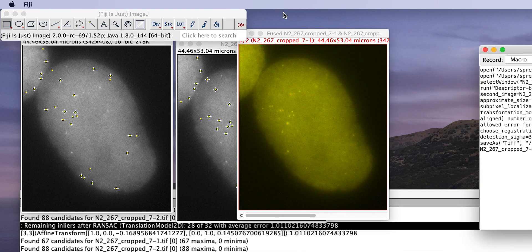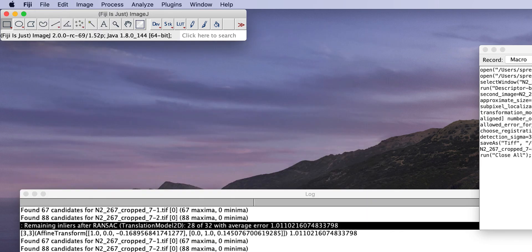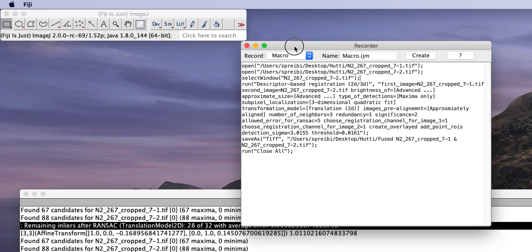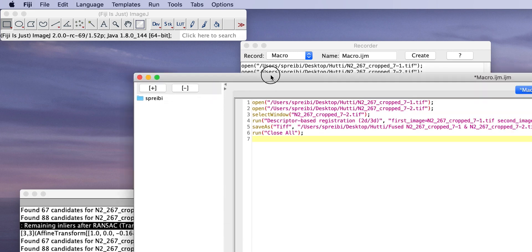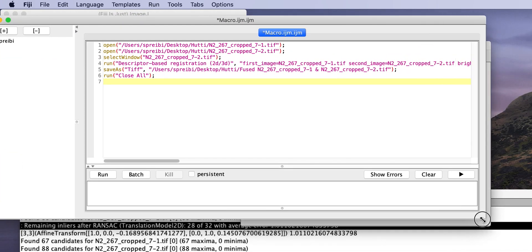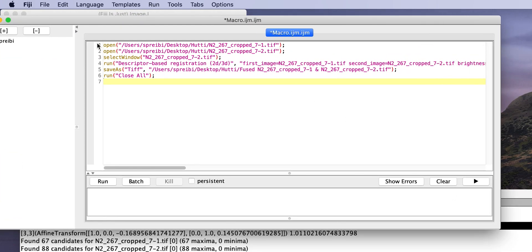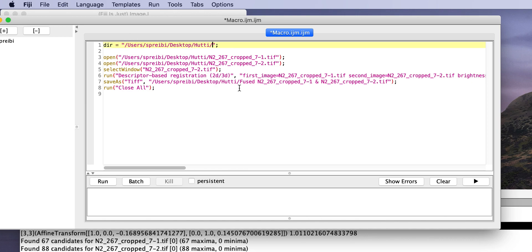And then, last thing you want to do is file, close all. And then, all the things are done. So, now we create this macro. Here we are. So, we would make a directory. So, you could, for example, auto-create this file then using Python, right? You could just create this file and then basically run it on whatever files you want.